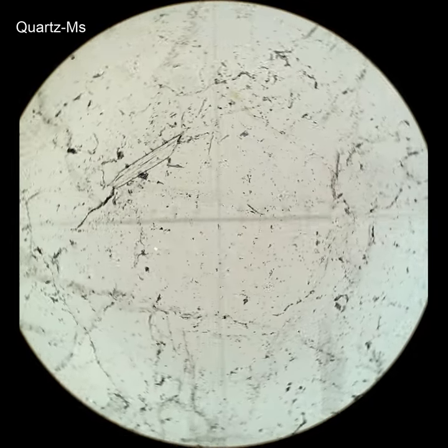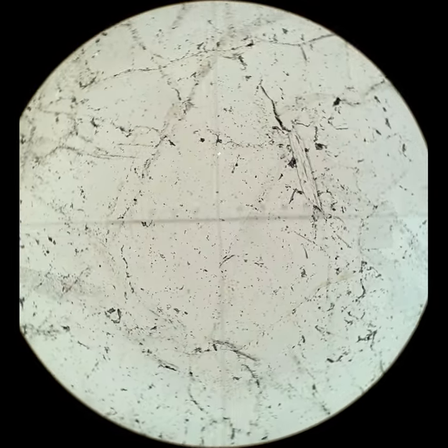And with this last one, I'm going to show you an interference figure. Here's a quartz grain, obviously centered, and when I cross the polars you'll see it's almost completely black. That means the c-axis should be pointing almost perpendicularly out of the thin section. So now if I go to higher magnification and put in the substage condenser, cross polars, and the Bertrand lens, then I can see that c-axis. If I put in the quarter wave plate, you'll see that it's blue in the northeast-southwest quadrants and orange in the northwest-southeast quadrants — and that tells you that it's uniaxial positive.